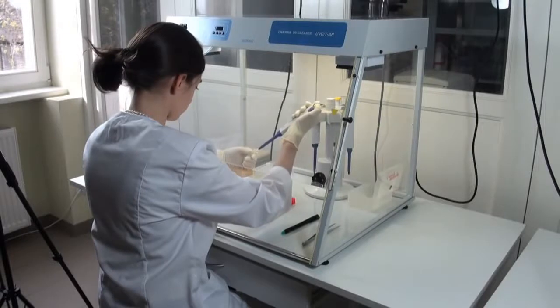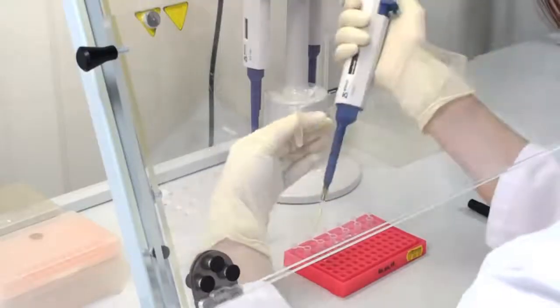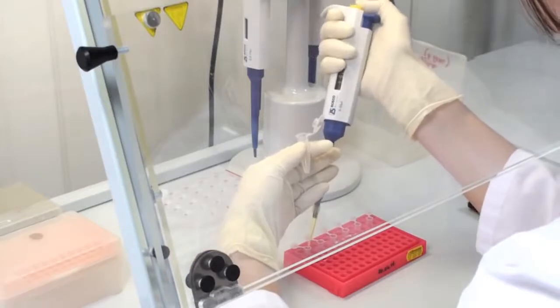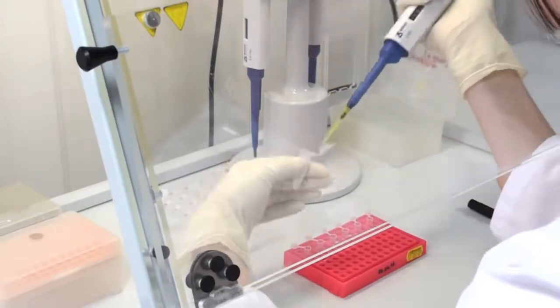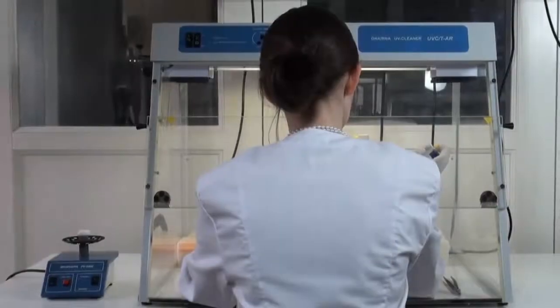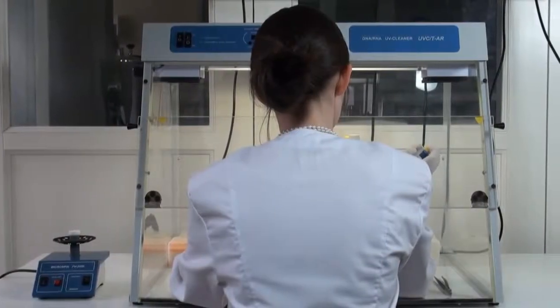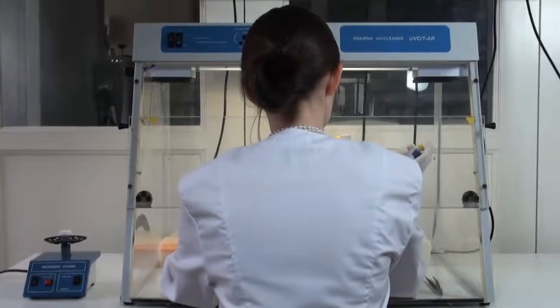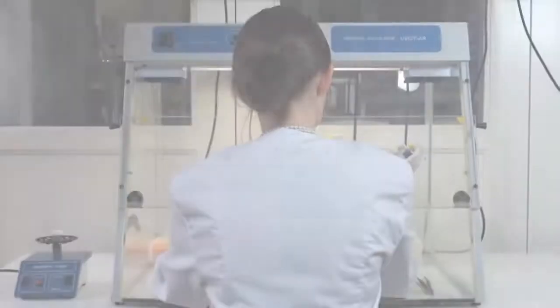UV Cabinets are designed for working with DNA and RNA samples by providing protection against contamination. All models are benchtop type, made of metal framework, glass or plexiglass walls, and working surfaces painted with powder enamel or made of stainless steel.